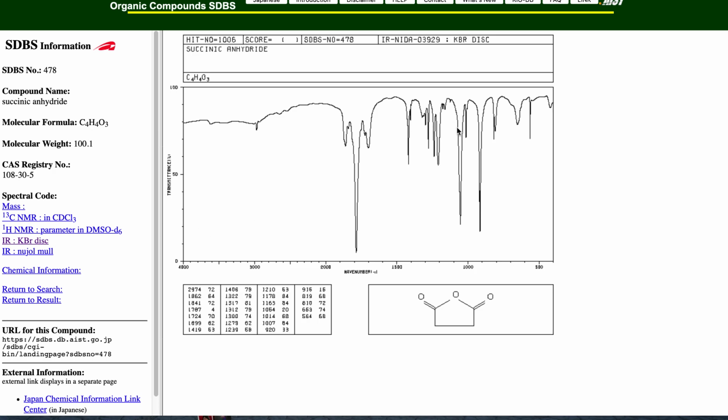Note the appearance. Then you can run what's called a Nujol mull. Now, I'm also an amateur artist and I paint. Very amateur, self-trained. And a mull is when you take a pigment and with mortar and pestle grind it up, maybe with linseed oil or water, to make your paint. You're mulling. Now, Nujol is a long hydrocarbon.